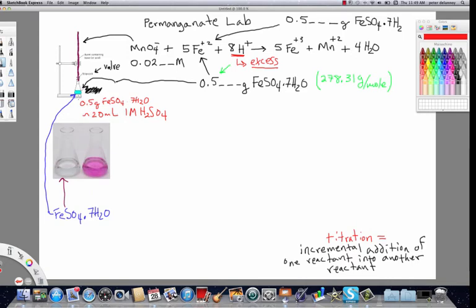Usually on these Erlenmeyer flasks, the first graduation that appears on the flask is at the 50 mil level, and so you can very easily eyeball the volume that you need by making sure you've added enough sulfuric acid so you're a little bit over halfway up to that 50 mil mark.